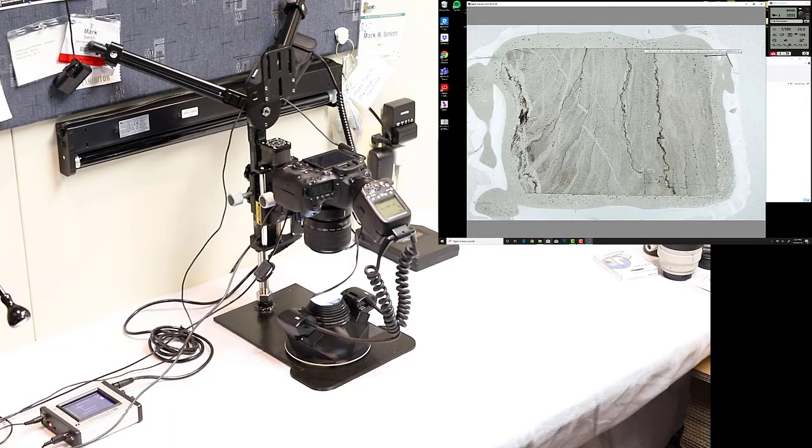So we'll let this finish. We've slowed everything down a little bit from our last demo and tutorial video, so that's why it's taking a little bit longer to take images, but it's not going to take too long. It'll tell us we have 13 more seconds, and then that'll be our first plain light image captured.